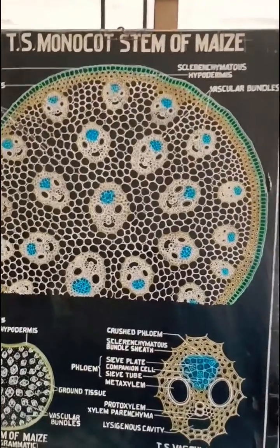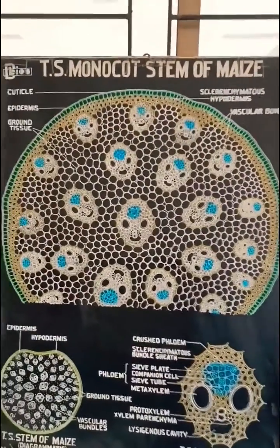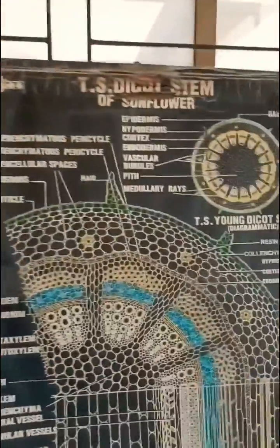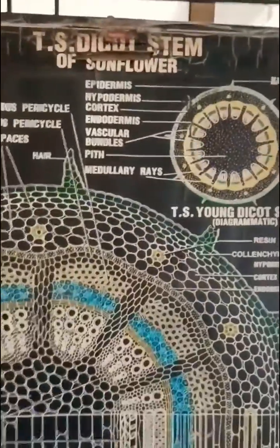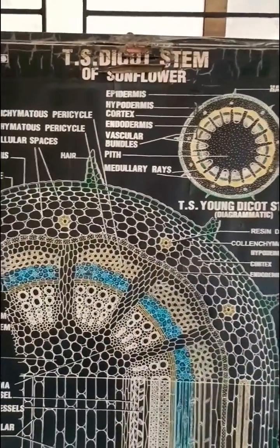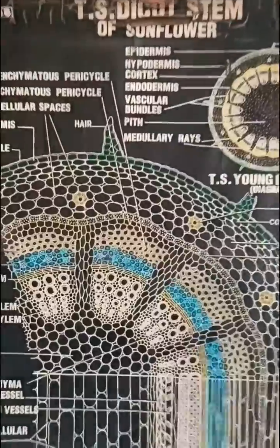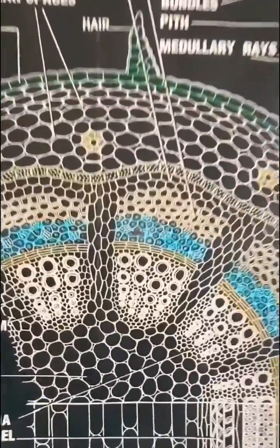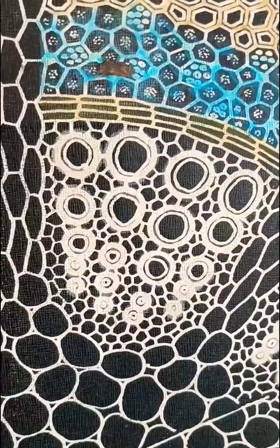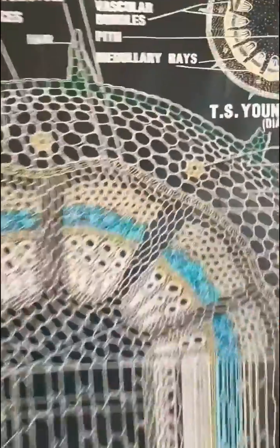This is monocot stem and this is dicot stem. Let's see first why it is stem. In stem, the condition is that protoxylem is towards the centre and metaxylem is towards the periphery. That's why it is stem.